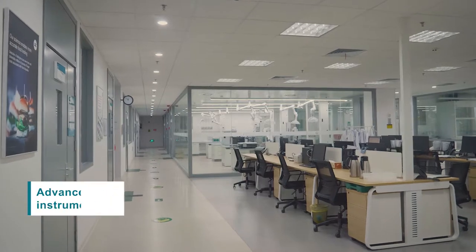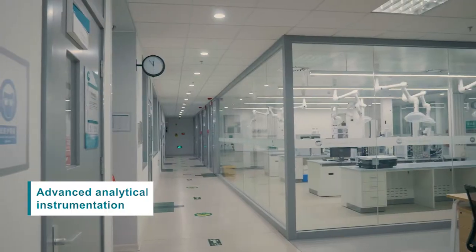Our high-precision, state-of-the-art laboratory is located in Nanjing's prestigious Economic and Technology Development Zone.